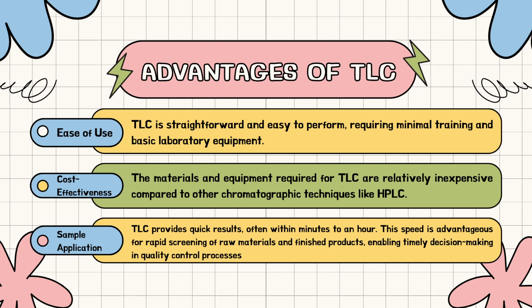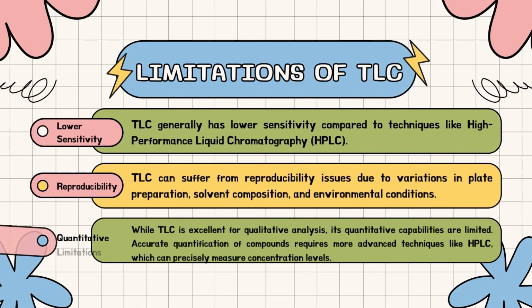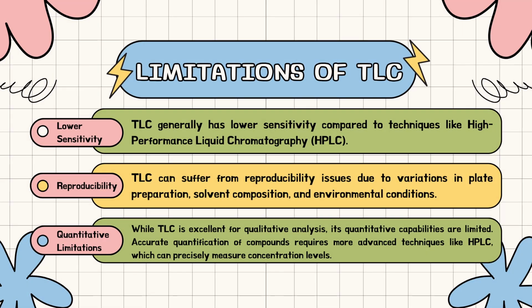TLC provides quick results, often within minutes to an hour. This speed is advantageous for rapid screening of raw materials and finished products, enabling timely decision making in quality control processes. TLC has its benefits. It also comes with its own limitations.